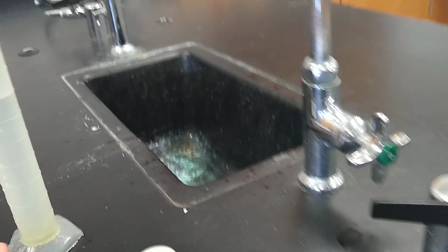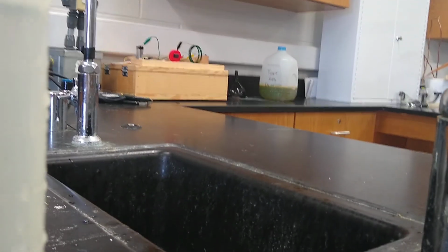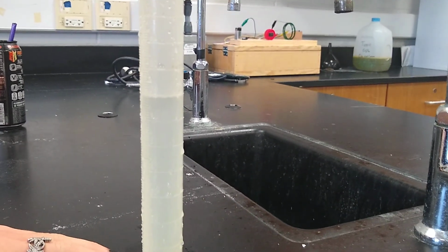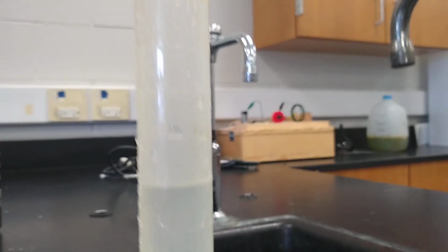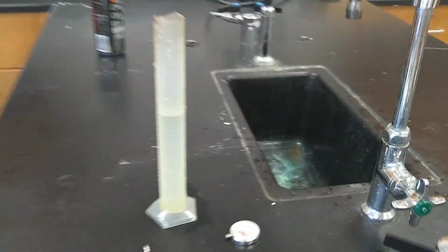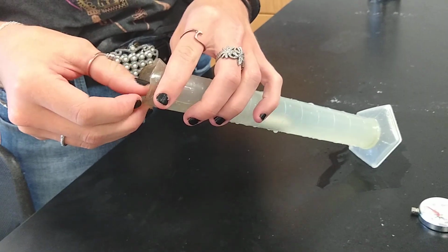Okay, so we're doing one right here. We've got some water in there, and we're going to read our water level. Can you read that water level for me? 69, I think. Okay, it's about 69 or 70. It's right between the two. Okay, all right, so that's where we're at. Then we're going to take this metal ingot right here. All right, ready? Put it in there for us. So lean it over. We're leaning it over so we don't spill any of the water.